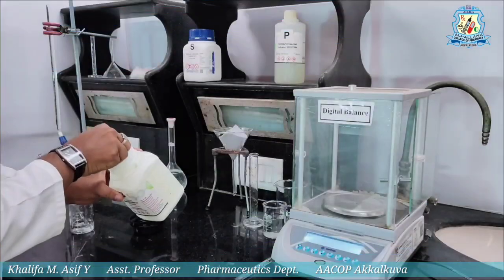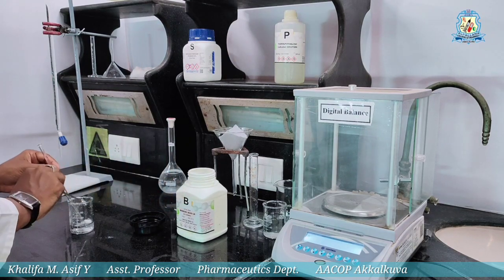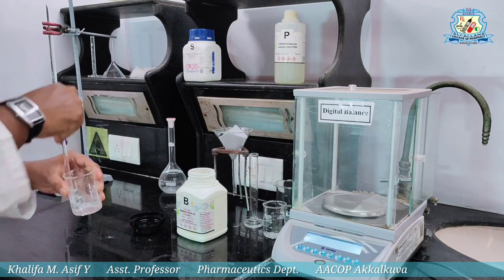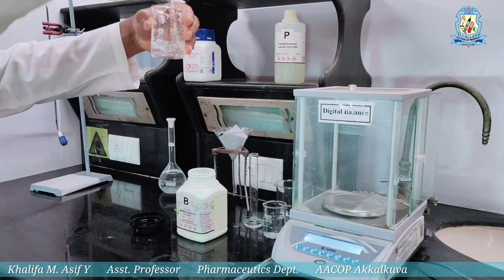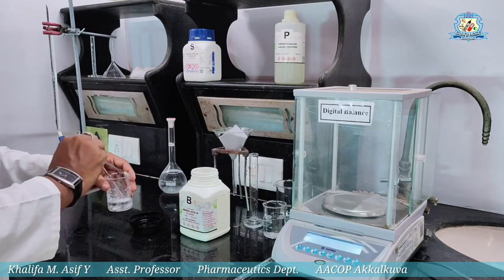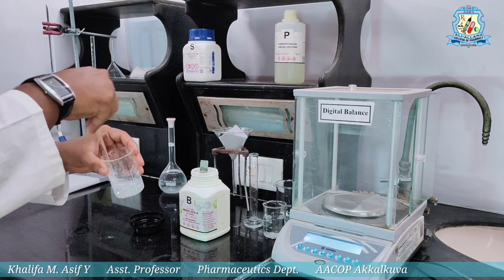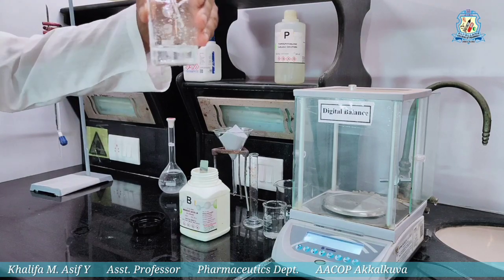Setup is ready. I will go for step 1, preparation of saturated solution. For that, I will take some amount of benzoic acid and try to dissolve it in distilled water by continuous stirring. For getting a saturated solution, I have to add excess amount of benzoic acid. By proper stirring, some amount of solute will dissolve in water.